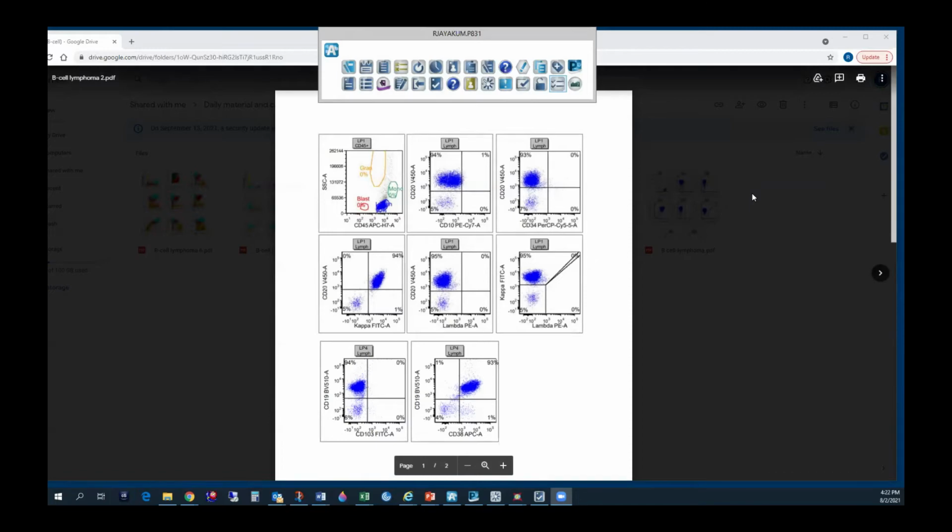Anything that we do give is how much percentage of that particular population is involved. So if 77% of the lymphocytes are involved, we say that too, right? Yes, that's it, and then positive, negative, you can say. In Kaluza, I have seen that they had a practice over here of telling the percentage for every antigen. I tried to remove that from the practice, and now me and another person are not doing it because it's not useful at all.